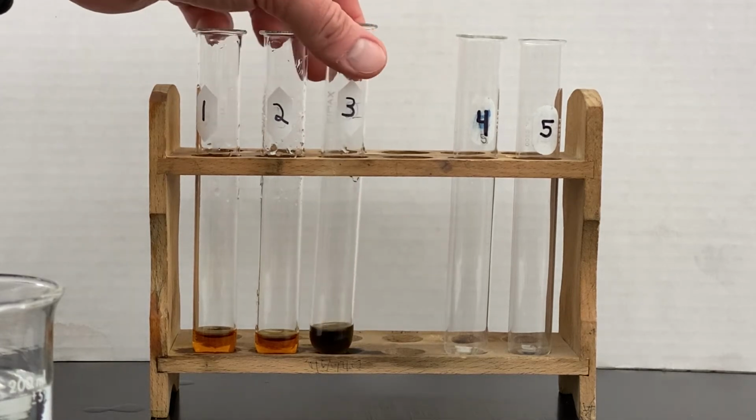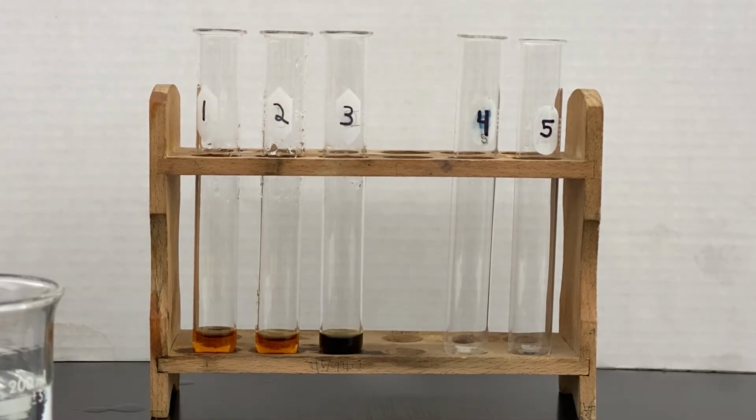And as you can see, we got a color change in the 3rd test tube. The 3rd test tube is now a dark, blackish, purplish color. Test tubes 1 and 2 look very much like the original color of the iodine. So we have a positive reaction in test tube number 3. Test tube number 3, remember, was the polysaccharide. So it looks like the iodine is very good at indicating polysaccharides.